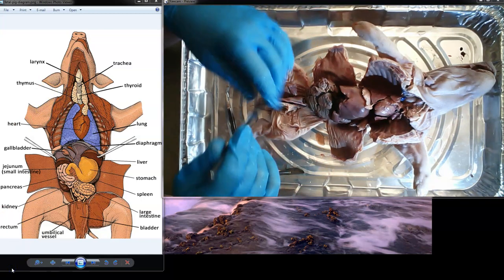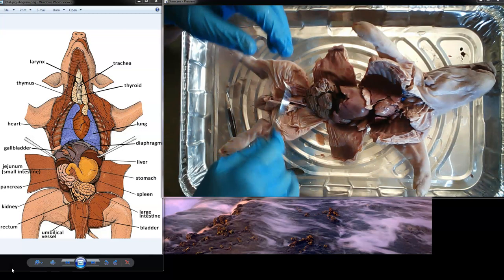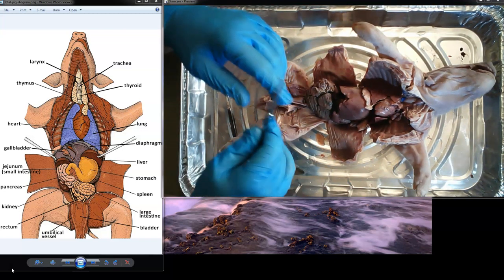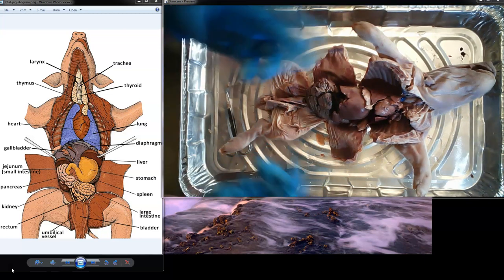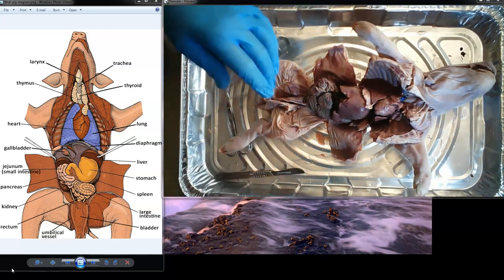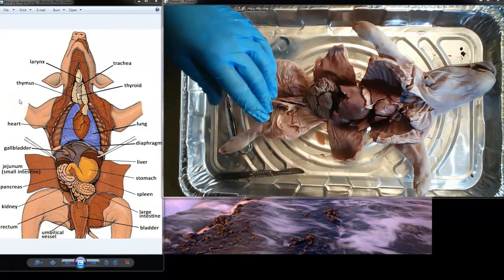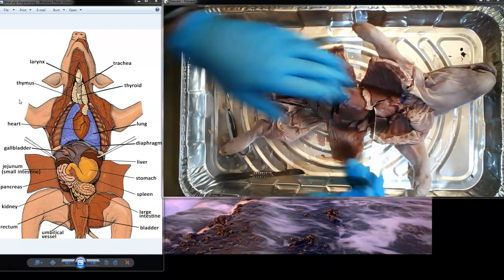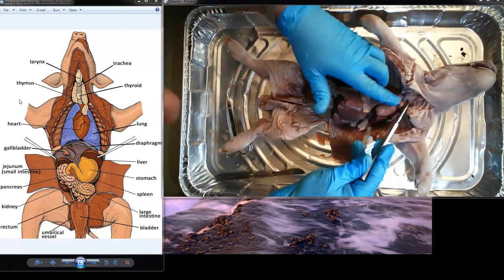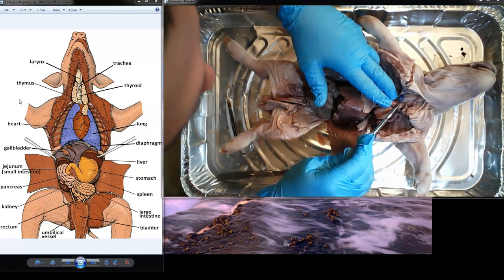All right, everybody, welcome back. So we paused to take a bathroom break and also to get a little flashlight ready. So my son is here with us, and we're gonna use my phone as my flashlight. He might get in the way of the picture as we go. I'm gonna try and keep him out, but we're definitely gonna try and get light from the top, pointing down this way, okay? So we can see color and stuff, all right? You guys are brother and sister. That's what happens. All right.